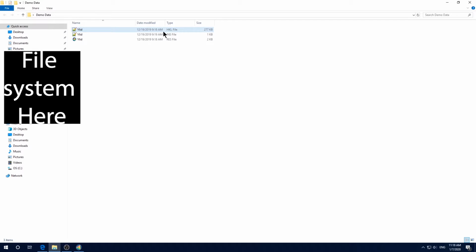Their file extensions are INS and HKL respectively. A lot of times, the INS file can also be replaced by a RES file. And it is probably more common to have all 3 files together: INS, RES, and HKL.